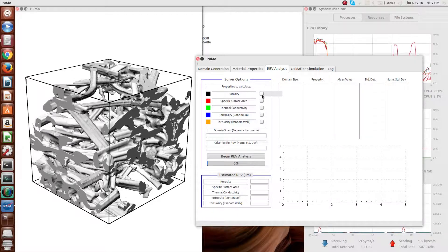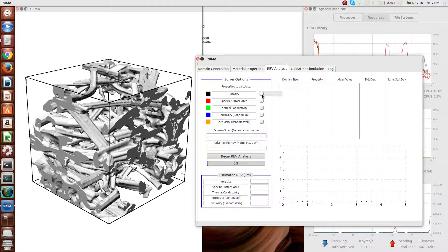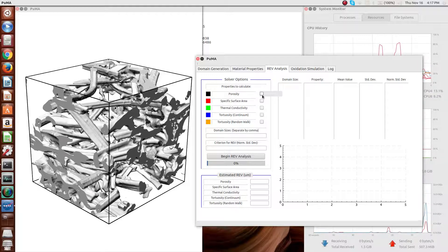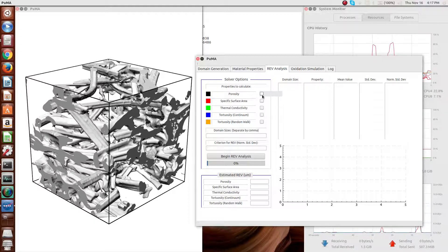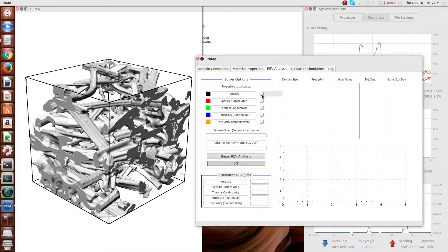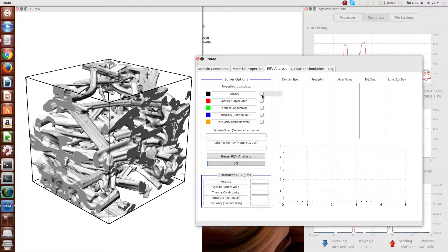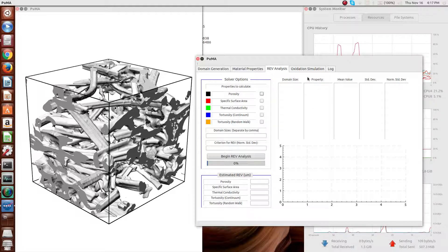The representative elementary volume can be computed for each of the properties separately because it actually varies for the property of interest, and the way we define this property is the size at which it doesn't matter where in the material you take the sample, the standard deviation of the values will converge to below a certain threshold, usually 1 or 2 percent of the property value.